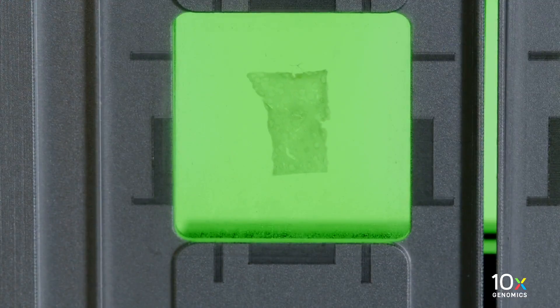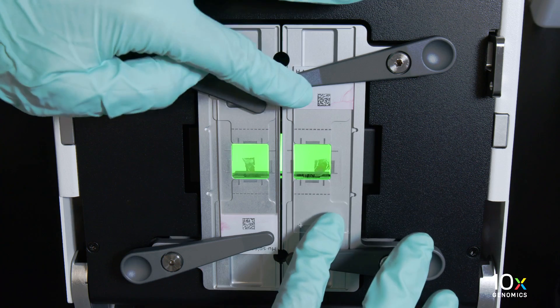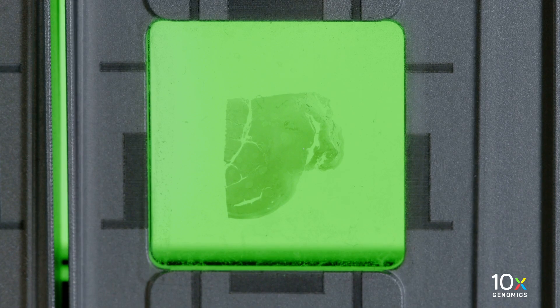Ensure that at least one clip secures the slide before adjusting the position further. Lay the tissue slide flat against the stage surface with the tissue facing away from the instrument. Use your fingers to center and finely adjust the position of the tissue sample within the alignment guides.